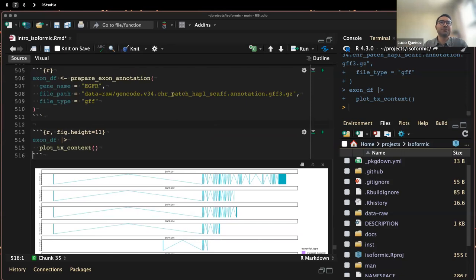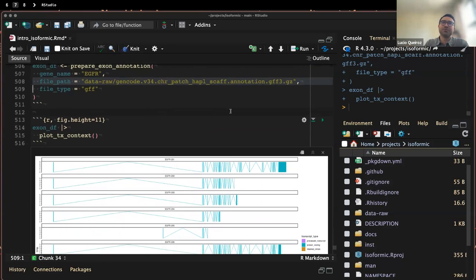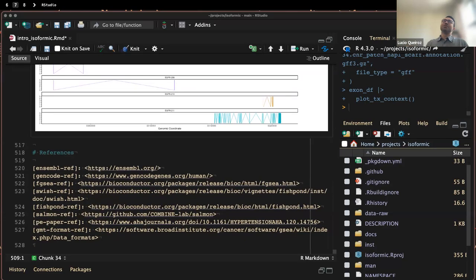Here we are using just the information from the annotation to plot, but like I said, we actually want to include some more functionality on that plot. And actually, you bring a really good discussion. Knowing that those genes have different transcripts that are totally different from one another, what is actually the functional element of the genome? Is it the gene? Is it the transcript? Is it the protein? There are a lot of concepts that need to be reworked around the gene concept.